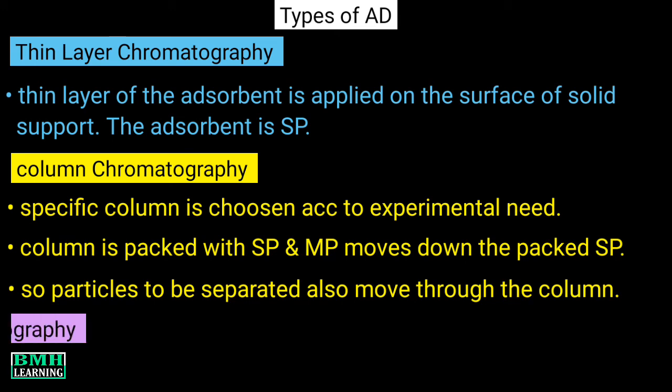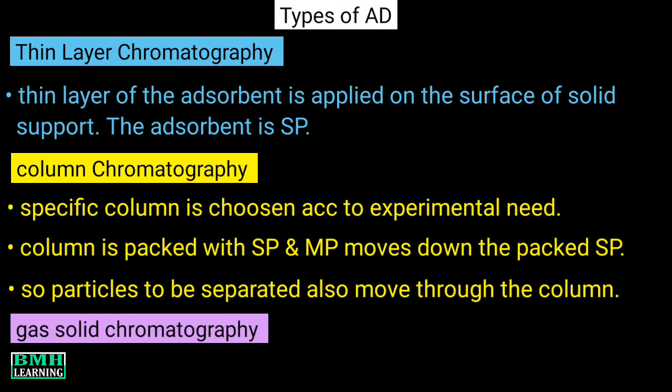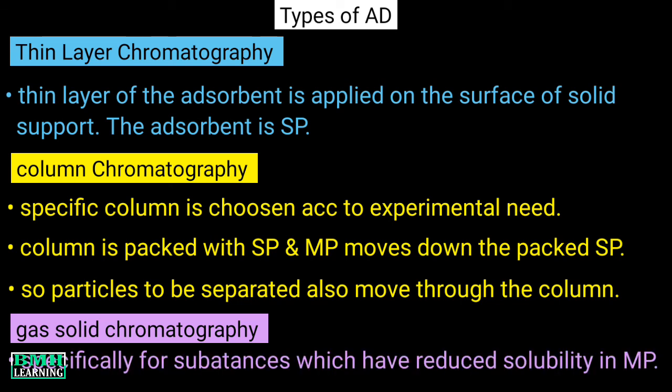Next variant is gas-solid chromatography. This is another type of chromatographic technique which also uses the principle of adsorption. But this is specifically for those substances which have reduced solubility in the mobile phase.